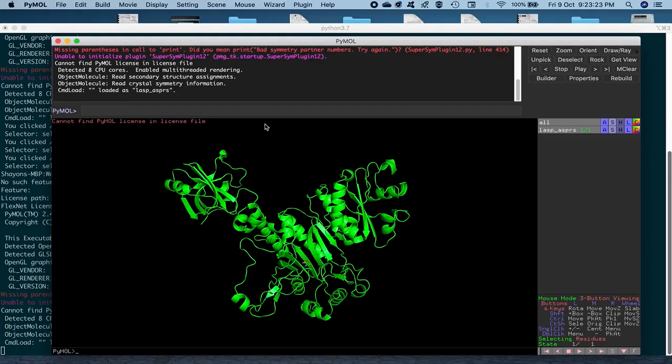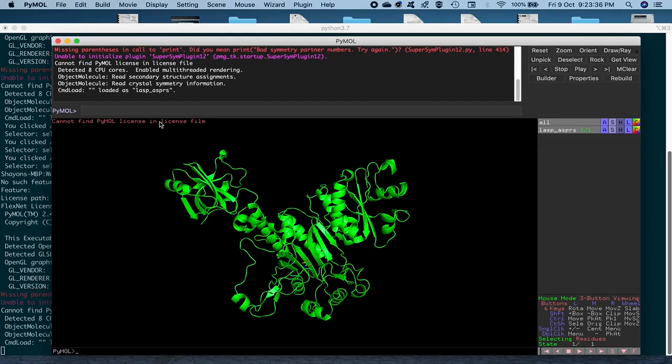So first thing that we got to do is display the sequence. So by doing that, it will be easier, it will be a lot easier for us to go along the sequence and then select a particular region or a particular residue out here.